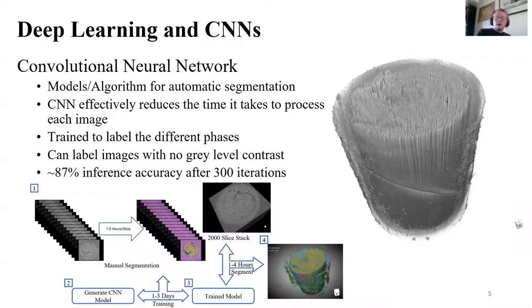The model is very good. You can train it to recognize different phases, different features in your samples, and it can also be used to label images with virtually no gray level contrast that might even be hard for a human to really tell the difference between fiber and matrix. I say here that we have around 87% inference accuracy after 300 iterations, but what does 87% accuracy really look like?